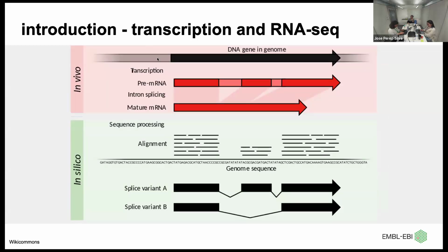What are we going to work with here? Or rather, what's RNA-seq? We will take all of these intermediaries from a given organism. Most often we will separate between different tissues, between different developmental stages, for instance.